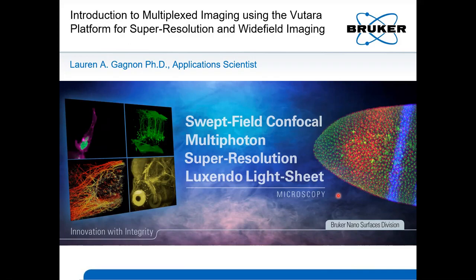This presentation will cover a brief introduction to single molecule localization with the Vutara system, and then focus on multiplexed imaging strategies, including DNA PAINT and Oligo-STORM.